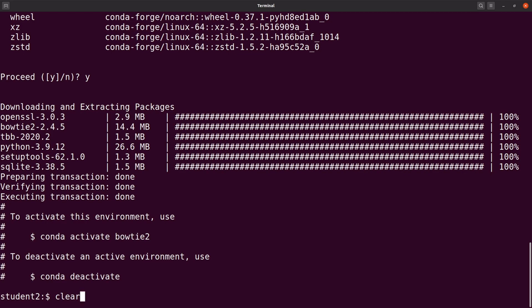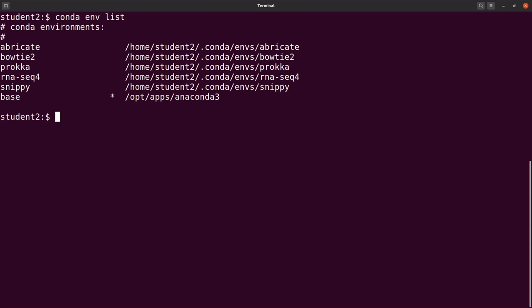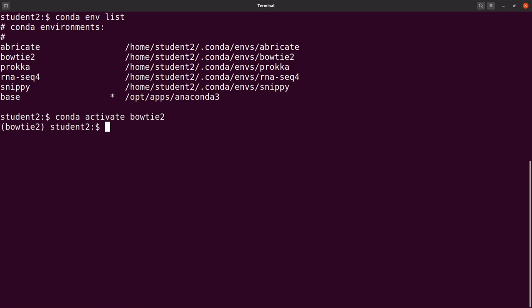We are now going to activate the environment. If you have forgotten the name of the environment, you can check using this command: conda env list. This will list the environments that you have created on your system, and we can see our environment here, the one we created. So to run Bowtie2, you need to activate it. So you say: conda activate bowtie2, and this will activate the environment for you.